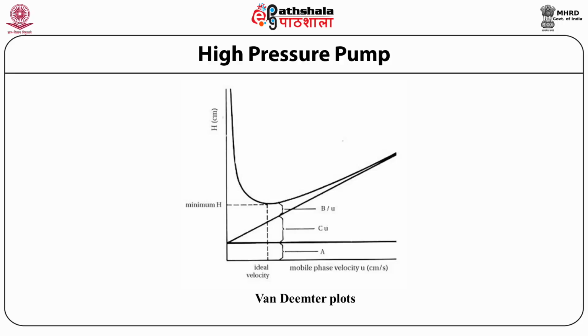Therefore, the pump system should be capable of delivering a wide range of reproducible flow rates, commonly ranging from 0.1 to 10 milliliters per minute with reproducibility of 0.5%, and to cope with the back pressures that arise due to the fluid flow. Appropriate adjustment of flow rate enhances run-to-run reproducibility so that the chromatogram of sample can be analyzed with respect to the one of standards or calibrants.